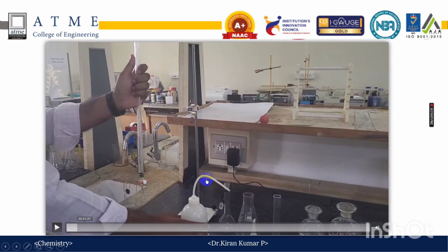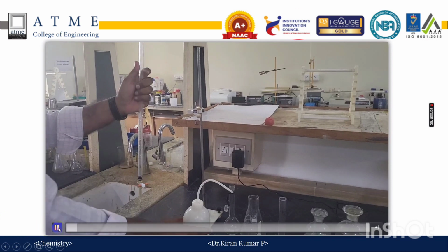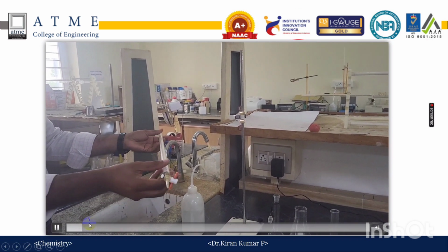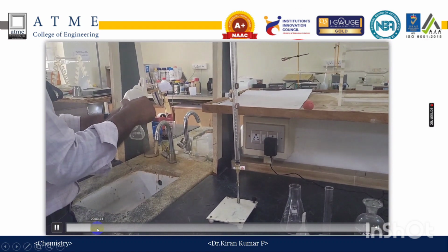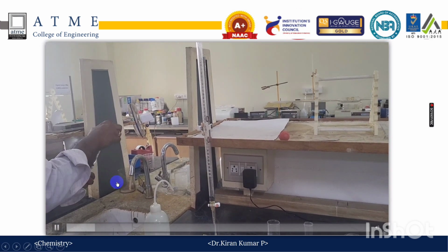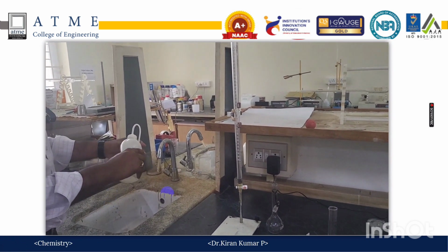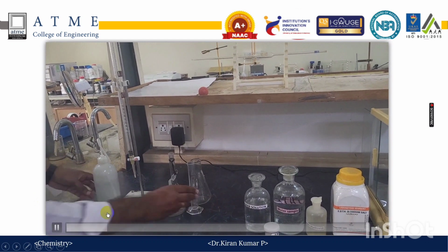Since we are dealing with hardness of water, it is mandatory to wash all the apparatus with distilled water to avoid contamination by the hardness present in tap water. So all apparatus are rinsed with distilled water, including the standard flask, the conical flask, and the funnel.